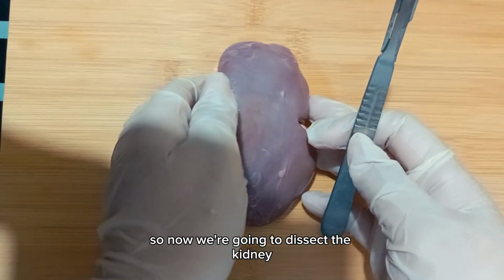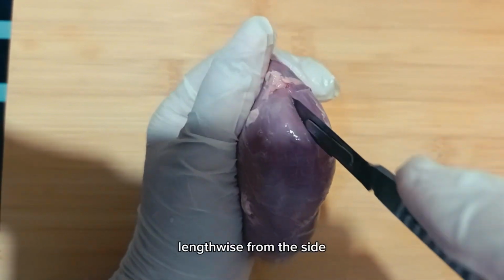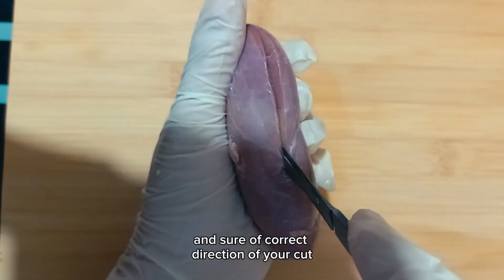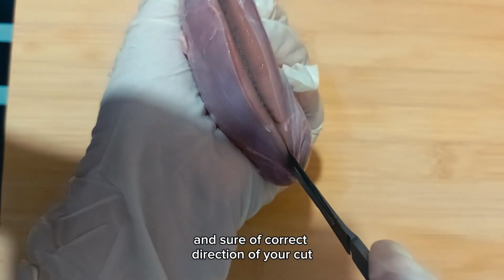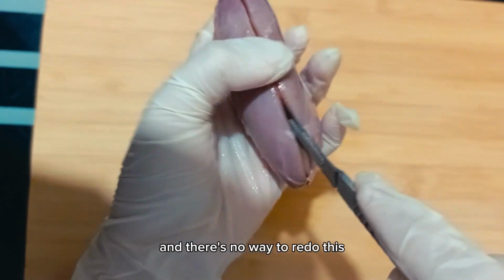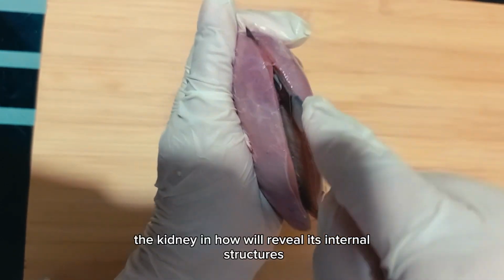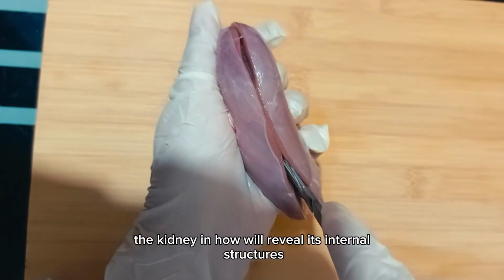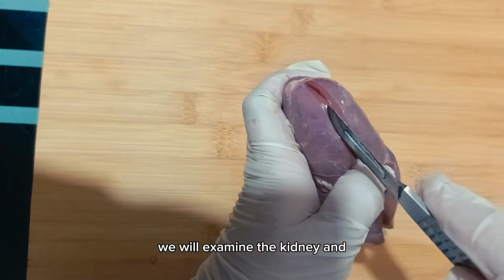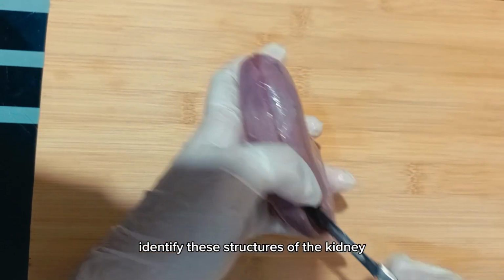So now we're going to dissect the kidney. Cut the kidney in half lengthwise from the side. Do not cut until you have checked and are sure of the correct direction of your cut. As a surgeon, you only get one chance to cut and there's no way to redo this. After splitting the kidney in half, we'll reveal its internal structures. After the cutting, we will examine the kidney and identify these structures.